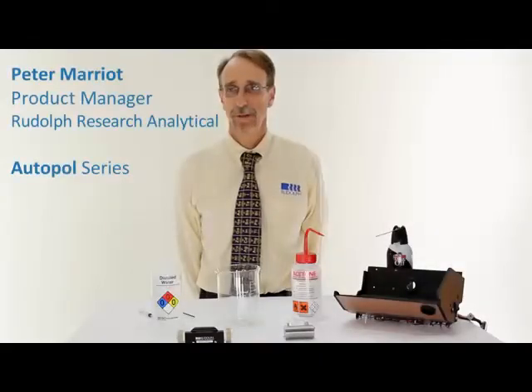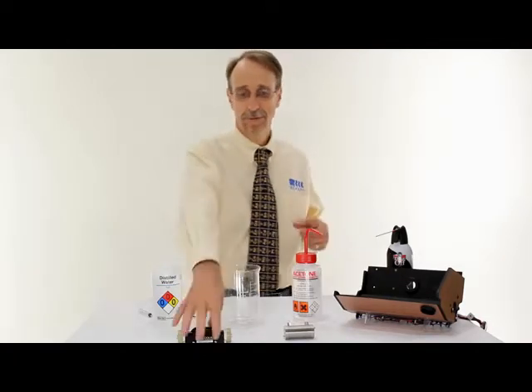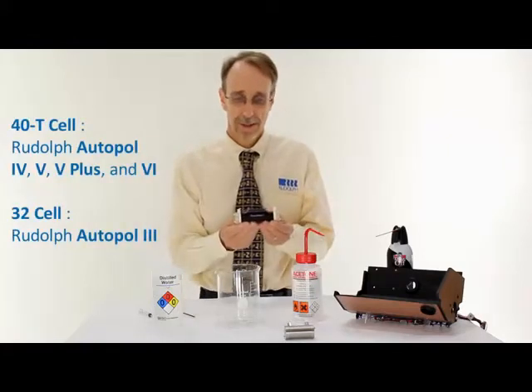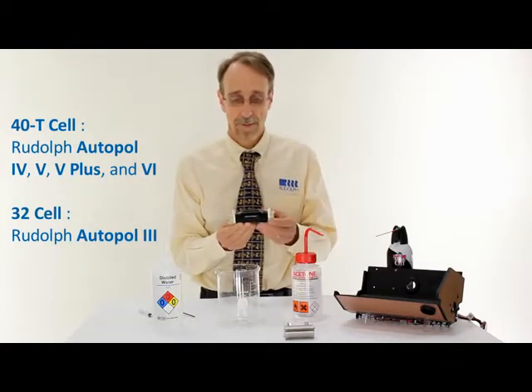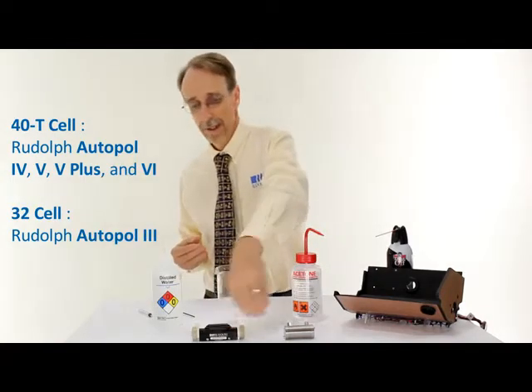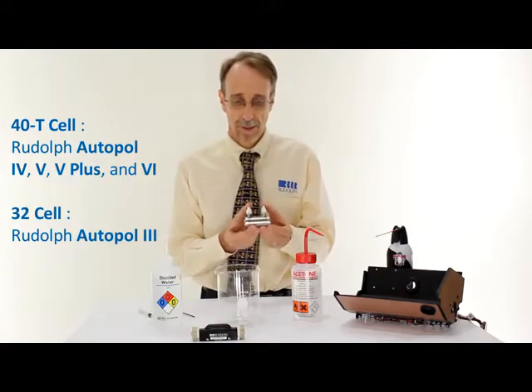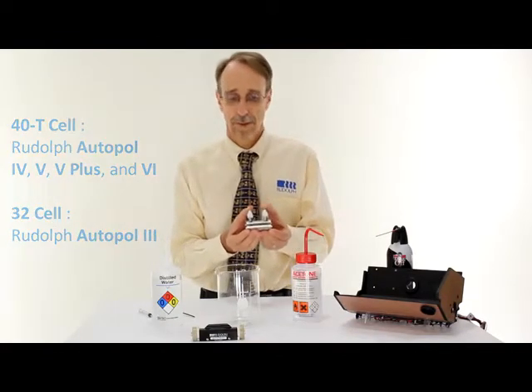This video gives a brief overview of the proper method of cleaning a Rudolf Polyrimeter cell. This video is relevant to the 40T cells — those supplied with an Ortopol 4 Temtrol, an Ortopol 5, a 5 Plus, and an Ortopol 6. It's also relevant to the 32 series cell, which are the low volume cells supplied with the Ortopol 3.